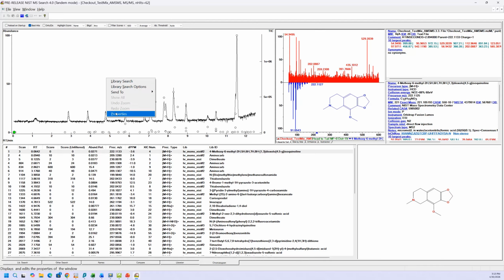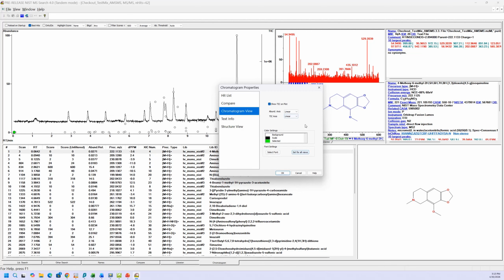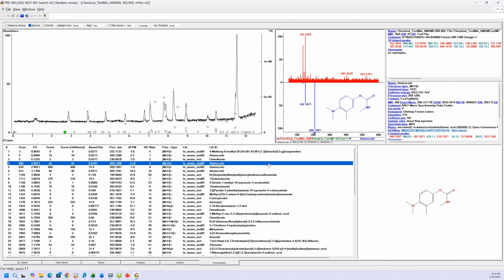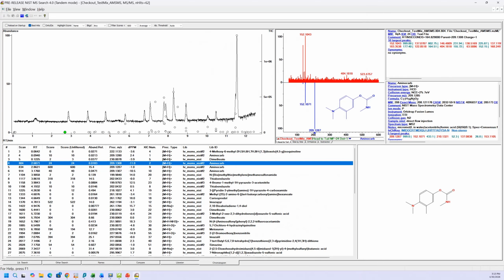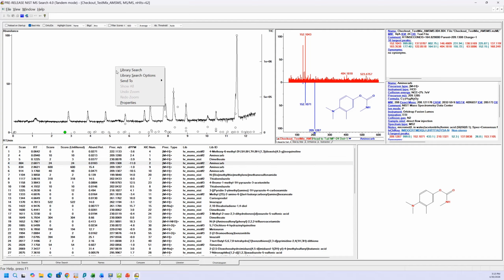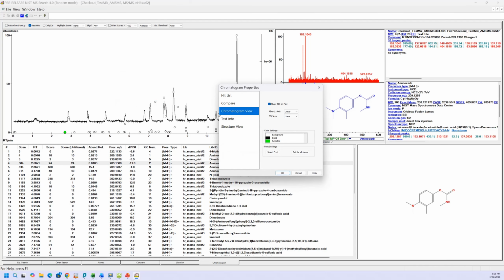The same thing here. If you go to properties, you've got help here for setting it up, or F1 and F1 here. So a lot of the things go to the same place, but those are the essential approaches for getting help in the program. So let's go to the properties menu here. You can see that there's a lot of different ways to look at the information here.